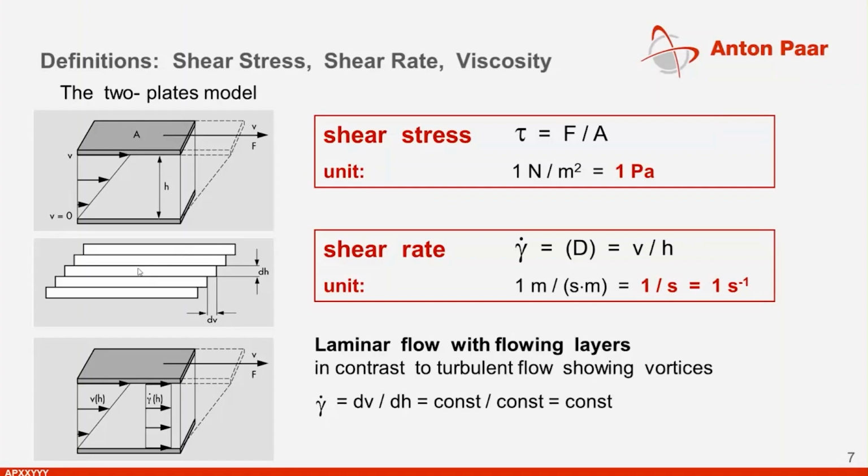On the other hand, the gap should not be too small, especially if we are measuring samples which include particles like binder mastics. Luckily, in the case we are measuring according to AASHTO T315, for example, the gap for each measuring system is predefined in these standards.